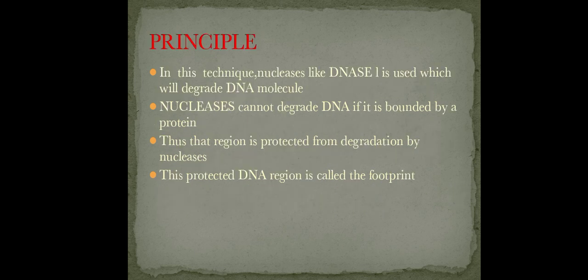Principle. In this technique, nucleases like DNase I are used, which degrade the DNA molecule. Nucleases cannot degrade the DNA if it is bound by a protein. Thus, that region is protected from degradation by nucleases. This protected DNA region is called the footprint.